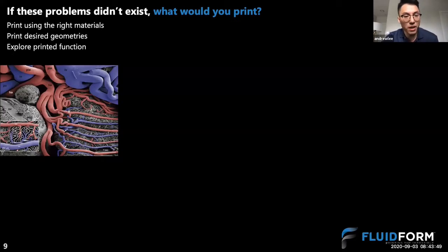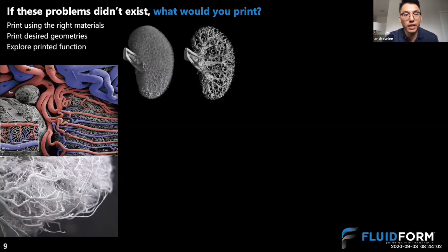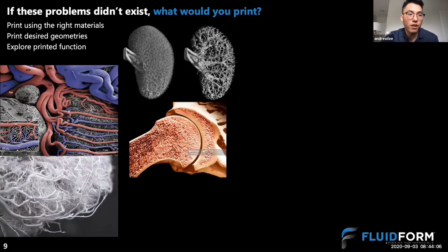So you might imagine, or I might imagine, you could start to replicate the full scale of the vasculature system within each organ, starting from the smaller capillaries, building up to the larger arterioles, and then having these vasculatures fill the volume of the organ. The bone is another example of different scales, architecture, and pattern that we really like, that really exemplifies the role of structure in function.